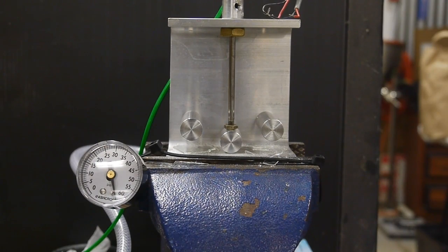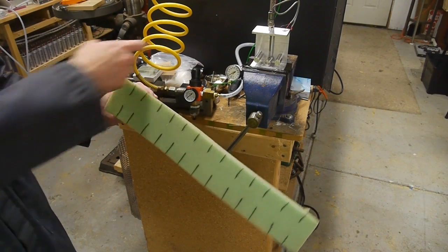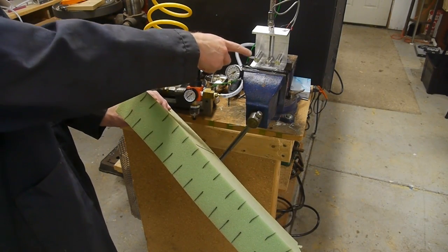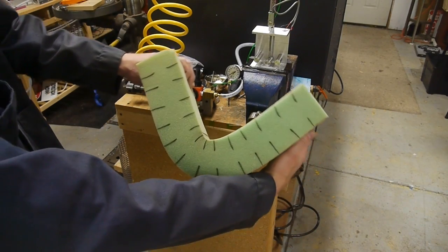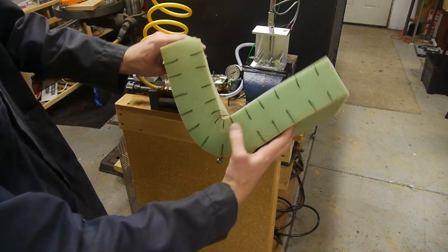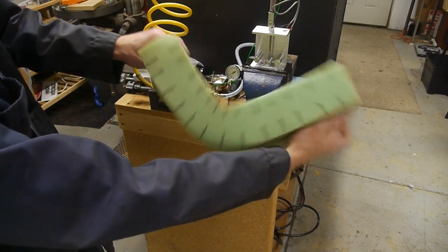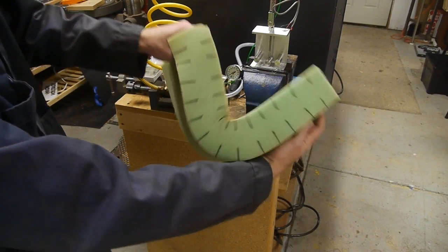Let's talk about what's actually going on here. When we bend one of the microscope slides in this test unit what's actually happening is the top of the slide is in compression, you can see the lines move closer together here, and the bottom of the slide is in tension.